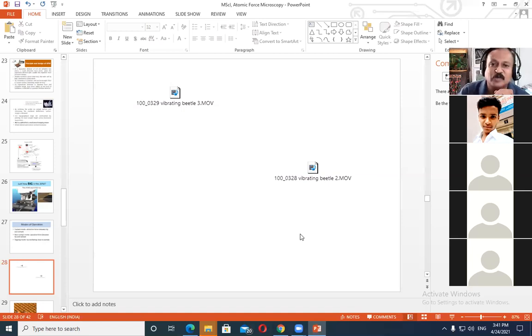So what I'm trying to tell you is we have already seen such a thing in our spectroscopies also, where we have seen the phenomenon of resonance. When a particular radiation interacts with matter, if the wavelength of that interaction matches, as we have seen in the vibration mode of infrared spectroscopy, when the molecules are vibrating, and if the frequency of the vibration and the frequency of the wavelength are matching, then that molecule is going to absorb the radiation.